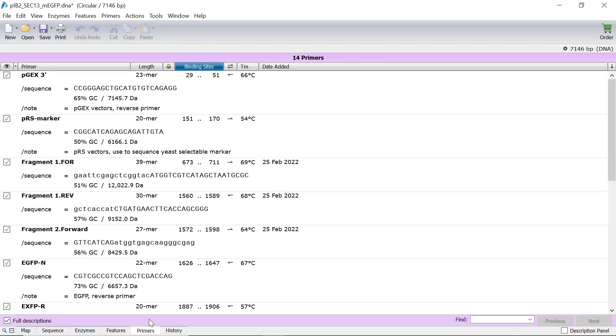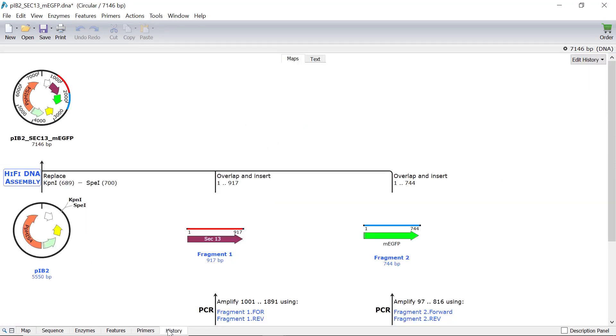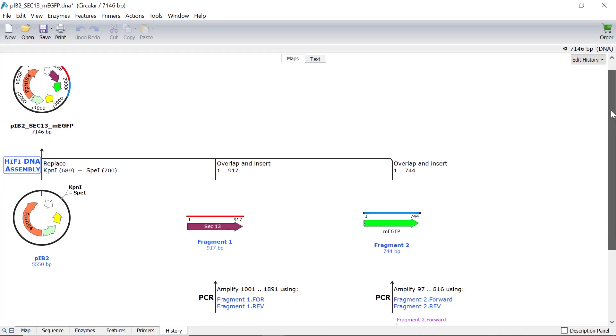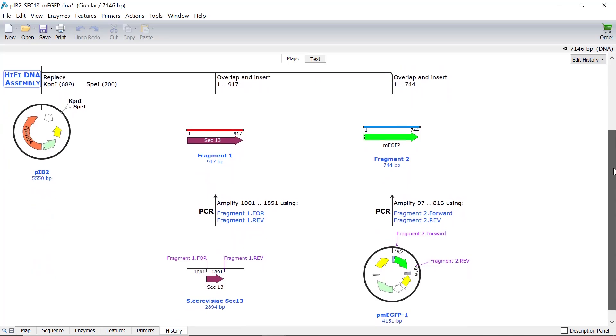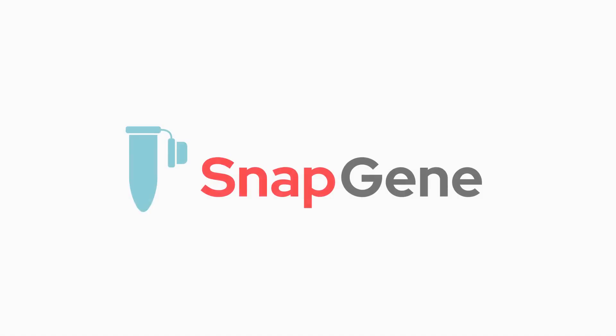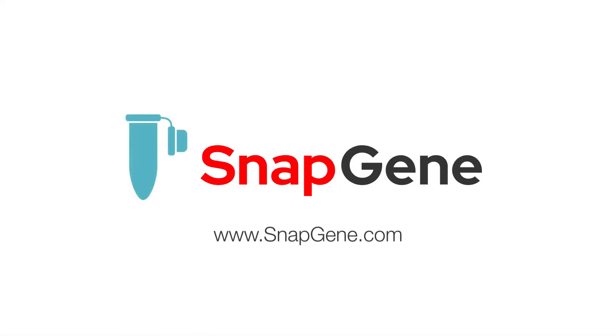And finally, the history tab describes the steps involved with the NEBuilder HiFi assembly to create this product. For more SnapGene tutorials, visit snapgene.com.